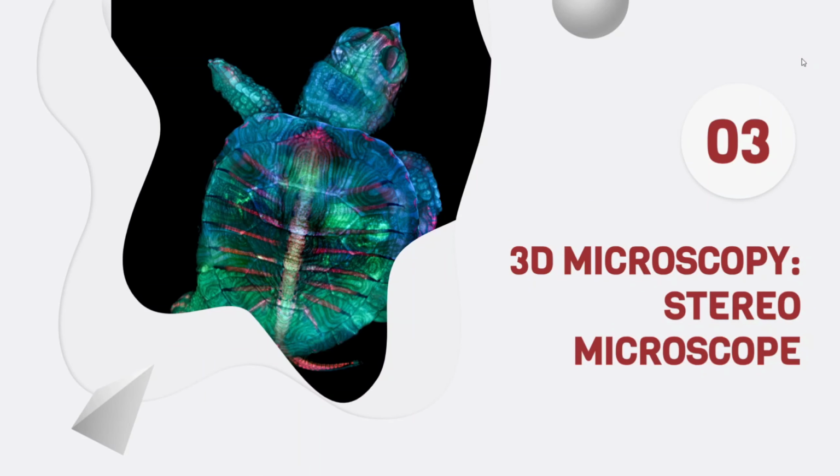A stereo microscope uses two separate objectives and two independent optical paths, allowing each eye to see the object from a slightly different angle. It relies on reflected light rather than transmitted light, making it ideal for observing the surface of opaque specimens. This design provides true three-dimensional images with a sense of depth, and the typical magnification ranges from 10x to 50x, offering clear detailed views of larger samples.